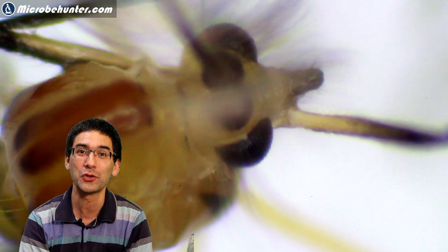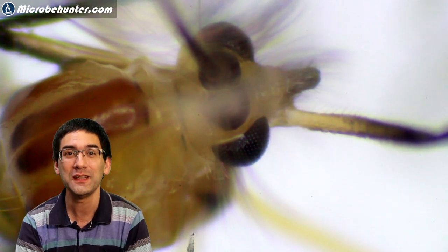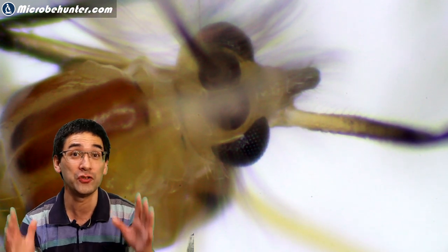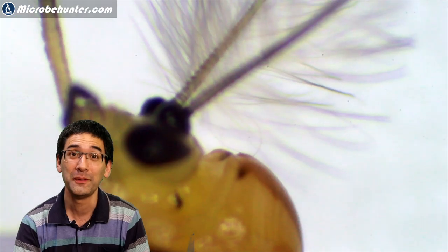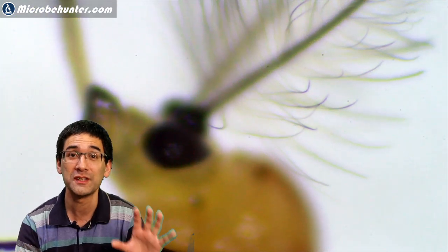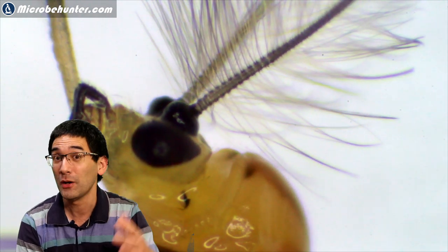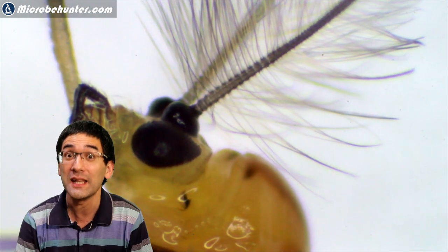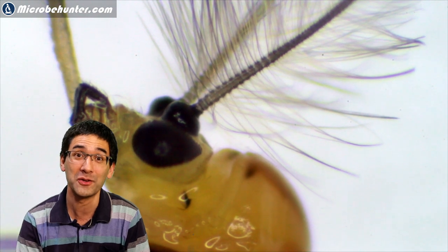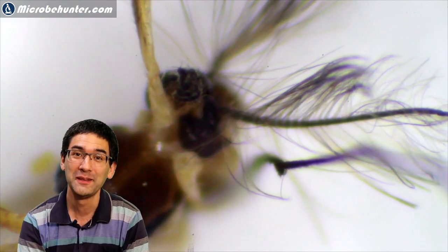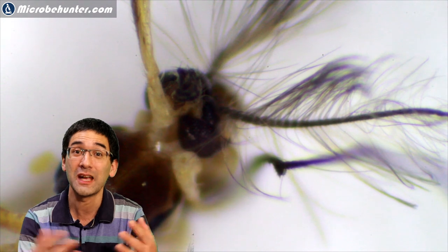One of the things you notice is that those mosquitoes have gigantic antennae. They use those to sense their mating partner, or even over a long distance, to sense if there's a victim somewhere to suck blood from. This is how diseases can be passed on.